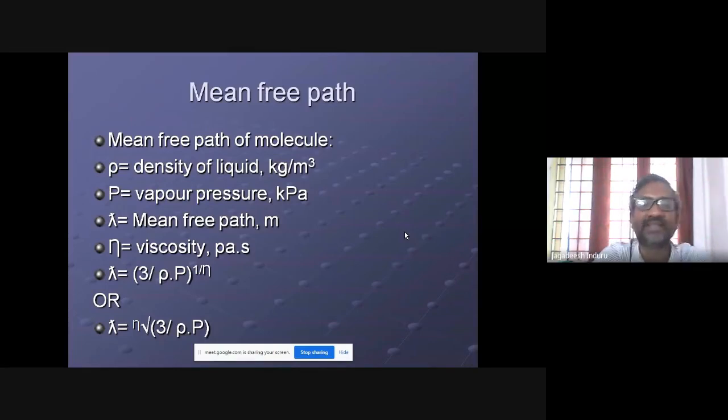So this is a major concept. And we have two types of equipment for this molecular distillation. These are very, very important questions for your sessional and final examinations, and they are frequently used in the natural products division. We are going to use them in practice also. So do memorize this, as there is a high probability of getting it in the exam.